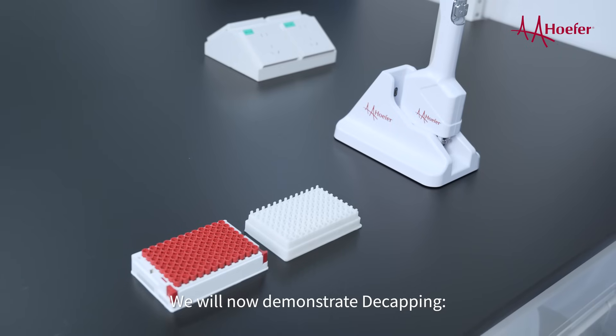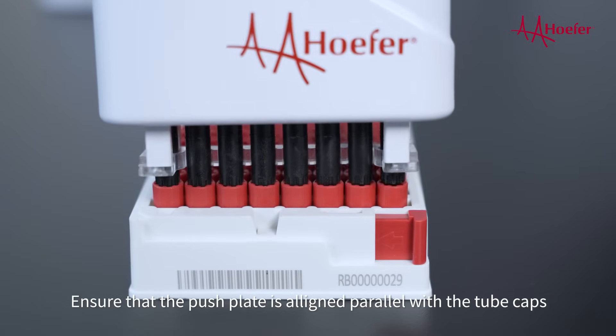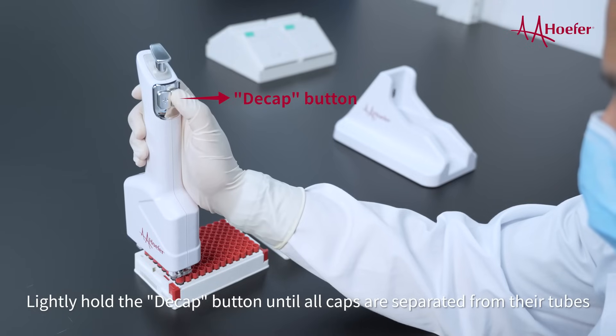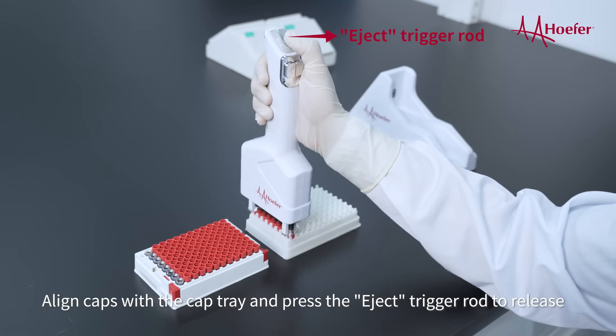We will now demonstrate decapping. Align the handheld cap with the row of tubes you wish to decap. Ensure that the push plate is aligned parallel with the tube caps. Lightly hold the decap button until all caps are separated from their tubes. Align caps with the cap tray and press the eject trigger rod to release.